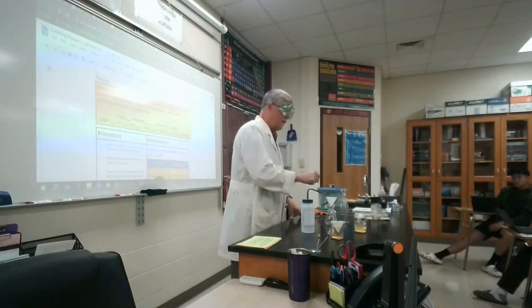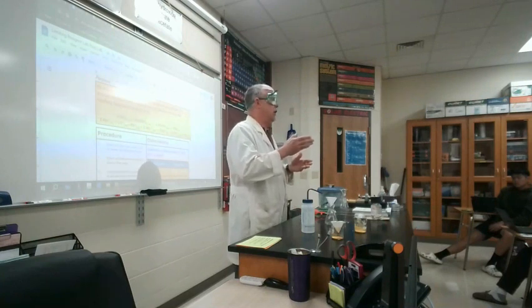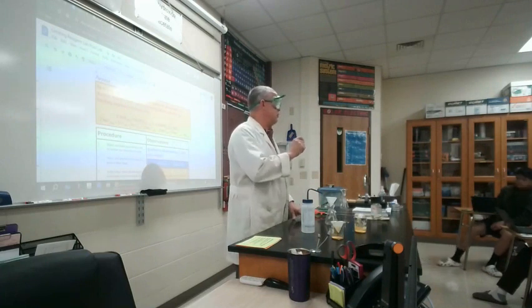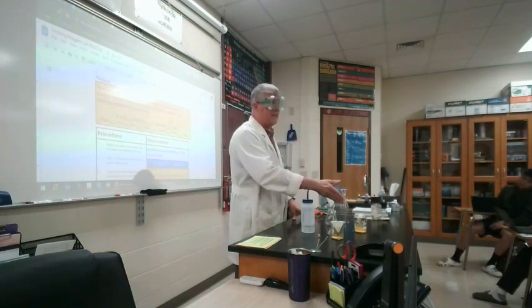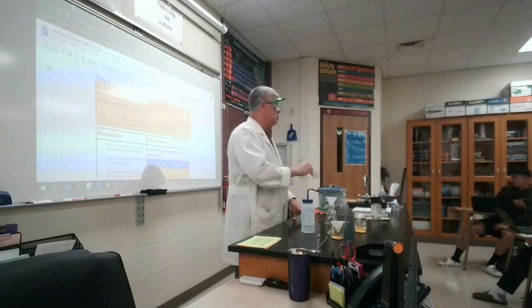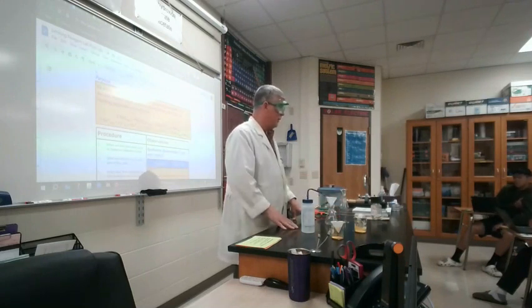If you put too much stuff in there, it will gum up the filter paper, and then your ions will start sneaking around the filter paper and end up in the bottom, and you will have to start over again. Pour slowly. Don't overload it. One of the best things that you have going for you is letting it sit and settle out. So don't rush to pour it. Okay? Let it sit, let it settle out.